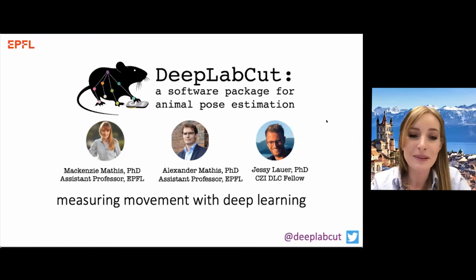In general, DeepLabCut is a software package for animal pose estimation. What this really means is that we allow you to track key points or items, pixels of interest, if you will, in animals or other objects across time. And we do this with deep learning.